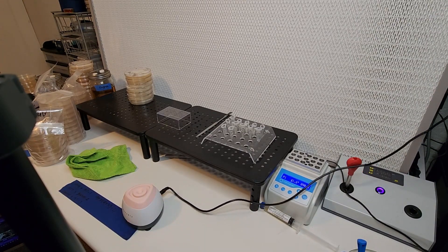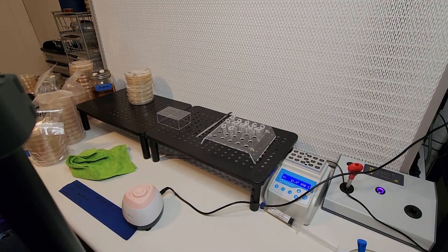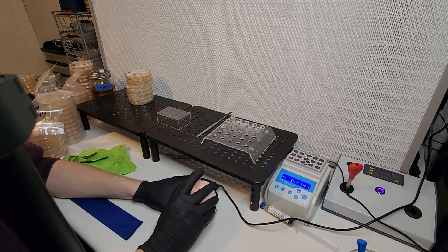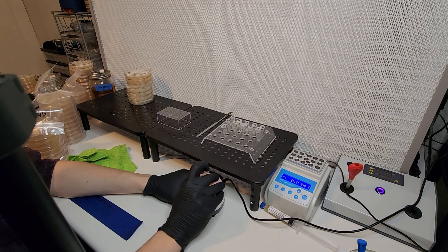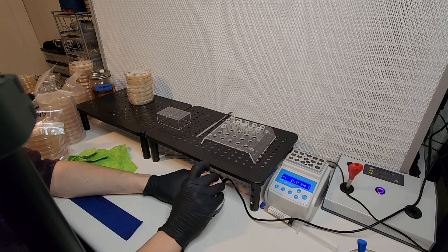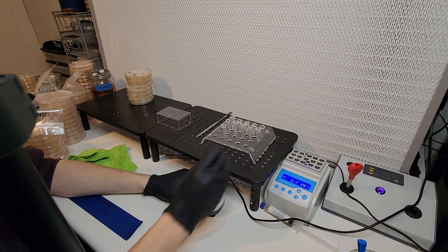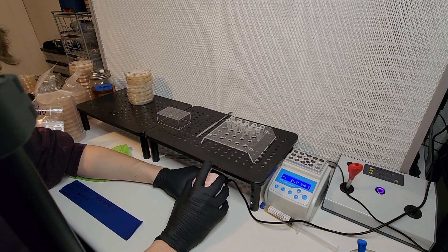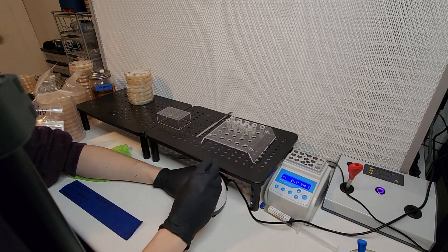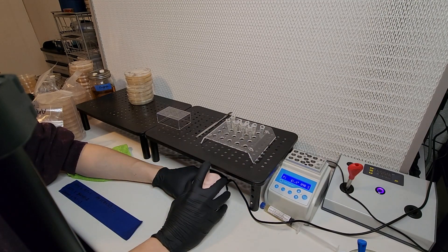This here is a makeup vortexer. It's a cheap version of a lab tool that's used to vortex these tubes to mix things up. You can buy these for cosmetics for like 60 to 80 bucks, something like that. Very affordable and they work fantastically well for mixing things up.